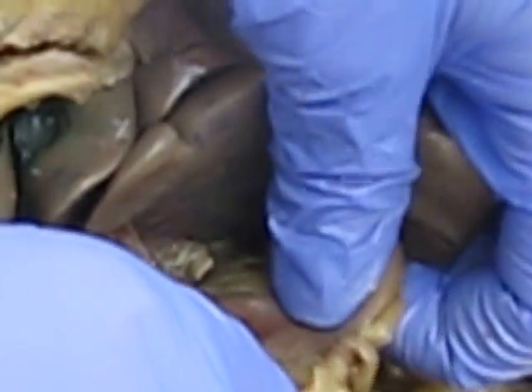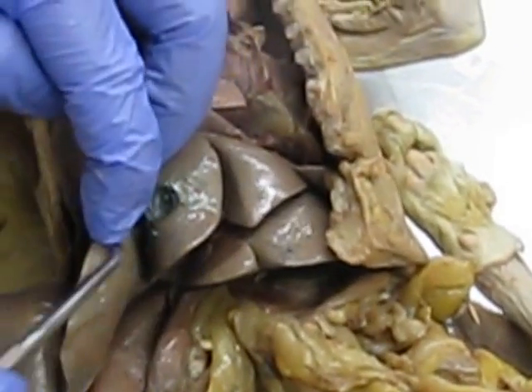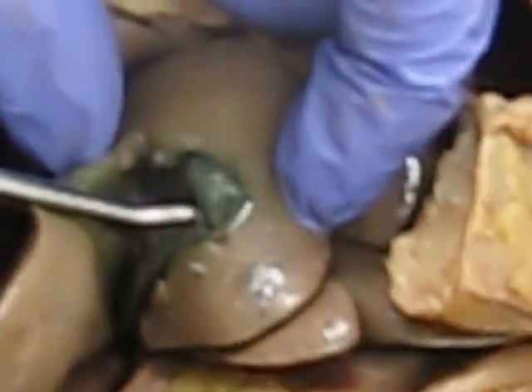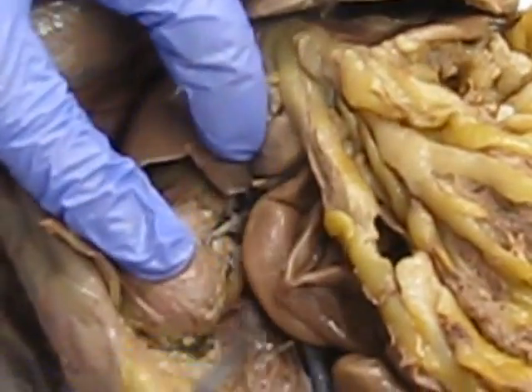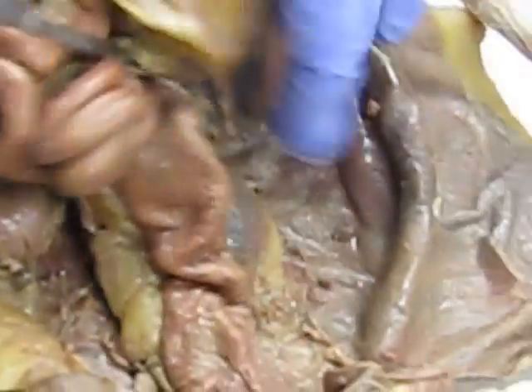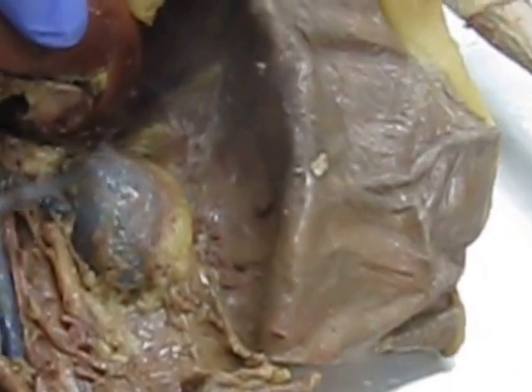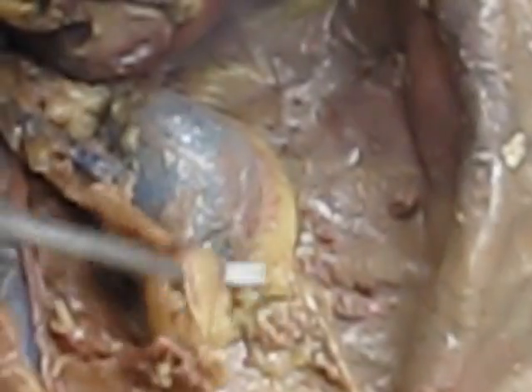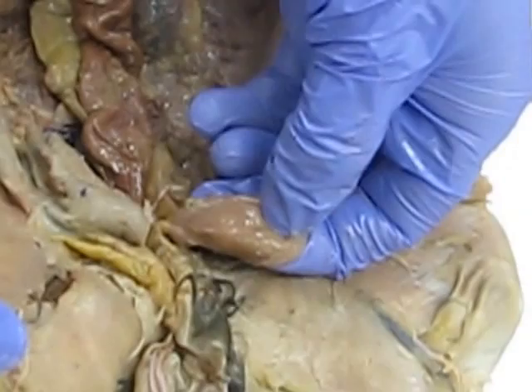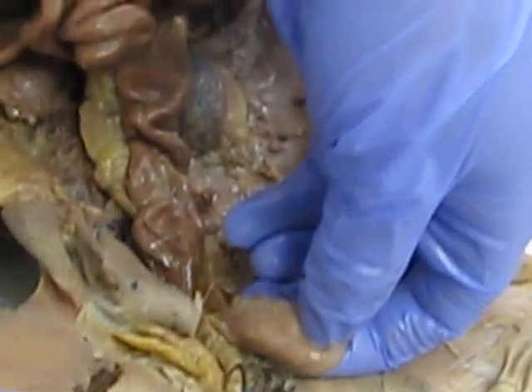If we again find the liver, just inferior to the liver is going to be the stomach, so we can see that here. We can also see the gallbladder, this sac-like structure here that's going to store bile. We can see our kidneys. That will be found on either side. And then if we take a look at the kidneys, we can find the ureter. And then this tube will extend all the way down to the urinary bladder, which is right here.